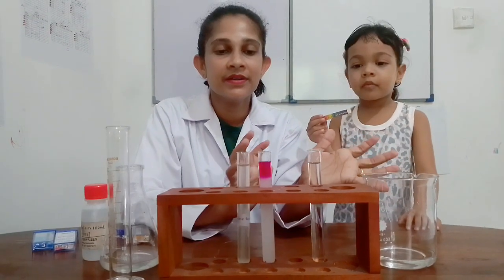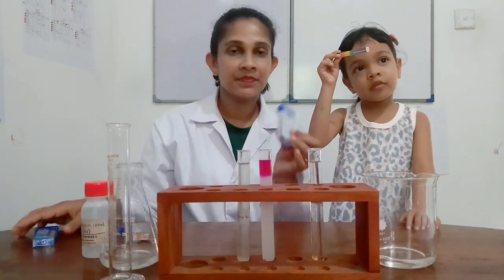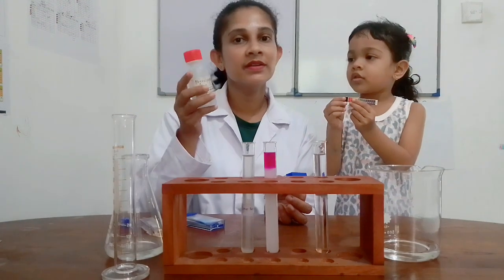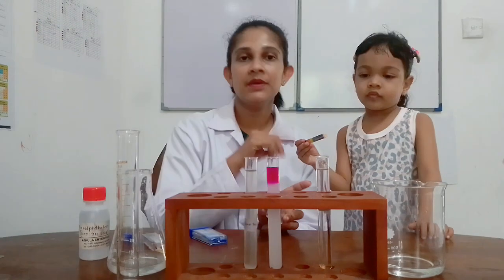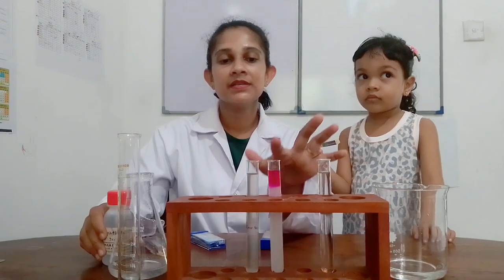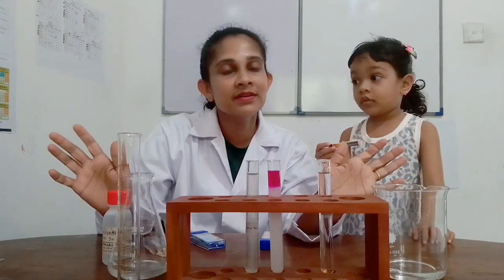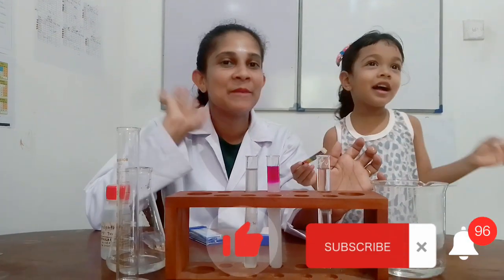Today we did acid, base and salt related practicals with red litmus, blue litmus and pH papers, and we also used phenolphthalein indicator. You observed the color changes of the pH papers and litmus papers as well as of phenolphthalein. In basic medium it turned into this beautiful pinkish color. You can meet in another experiment. Bye, guys.